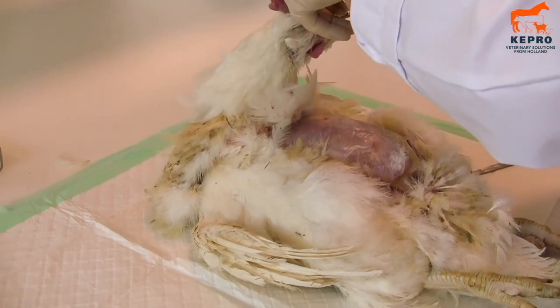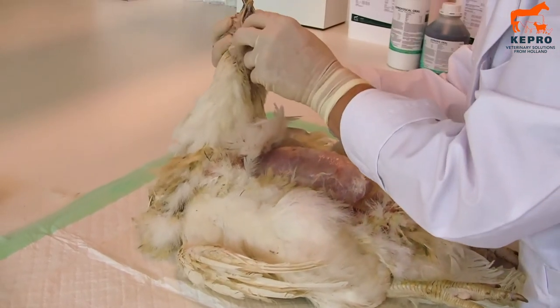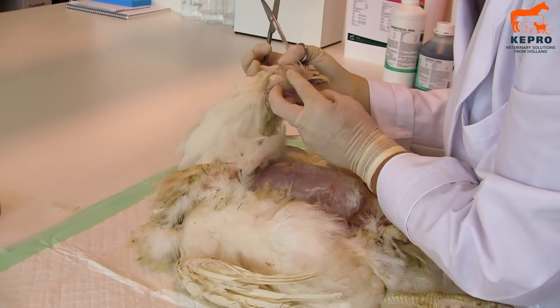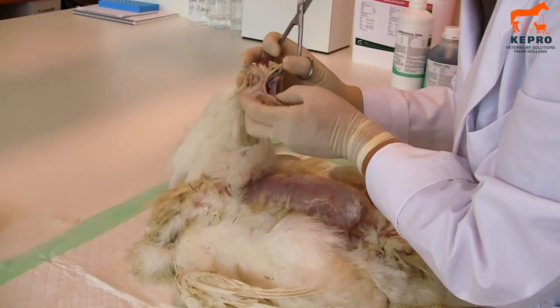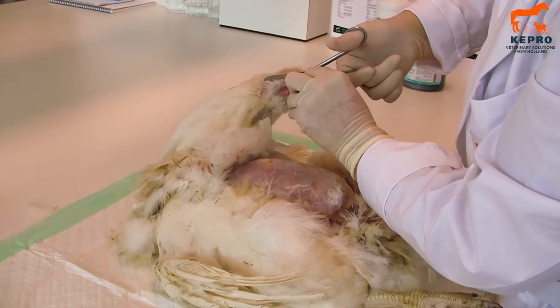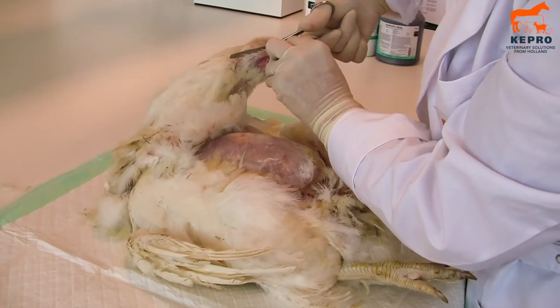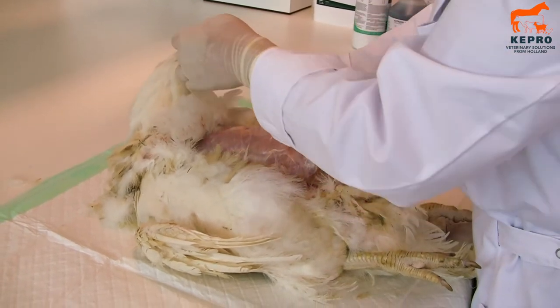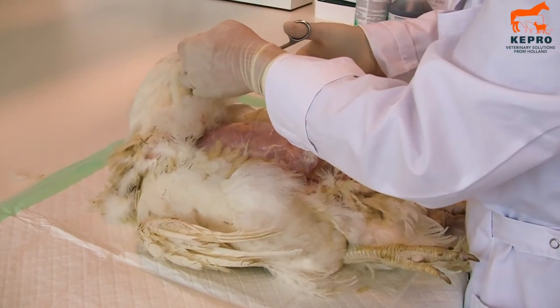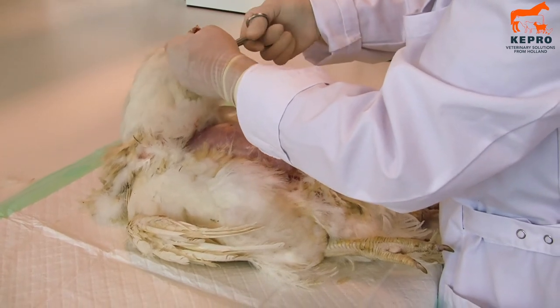First you look into the beak where you don't see any discharge. Look into the eyes if there is no discharge. This all looks fine. You can see this is a strong broiler breeder. Normally when you do this on a broiler chicken it's a little bit easier.